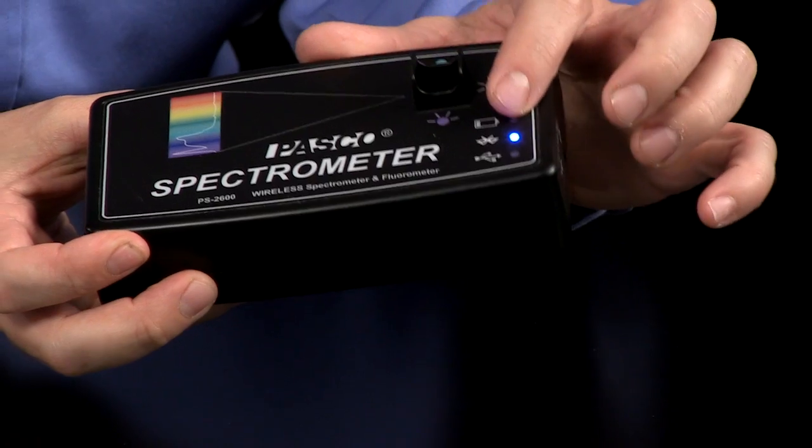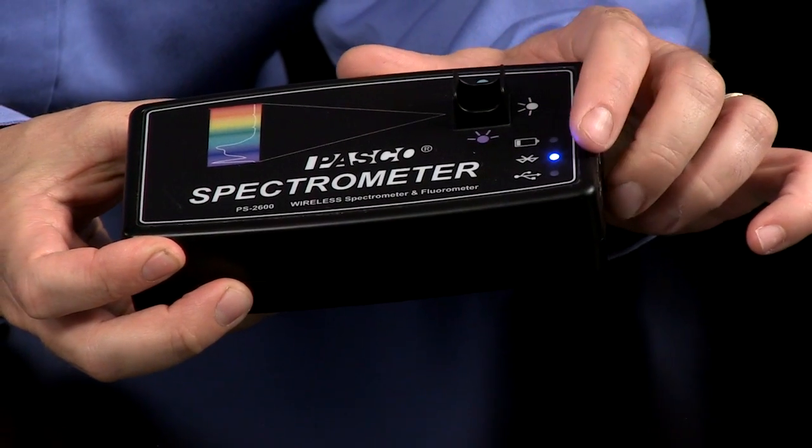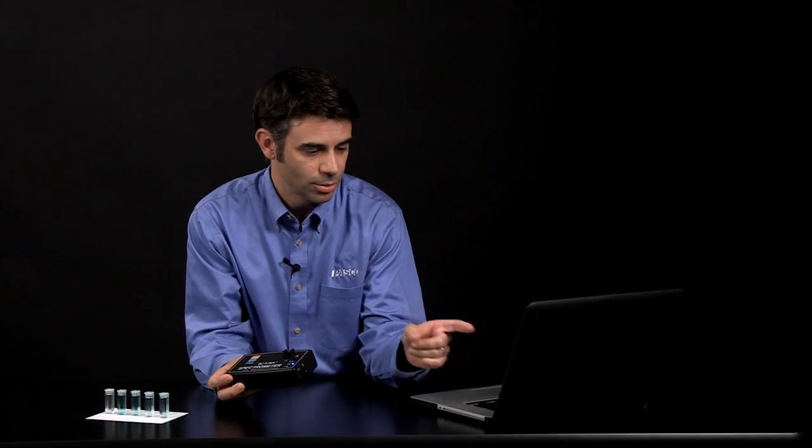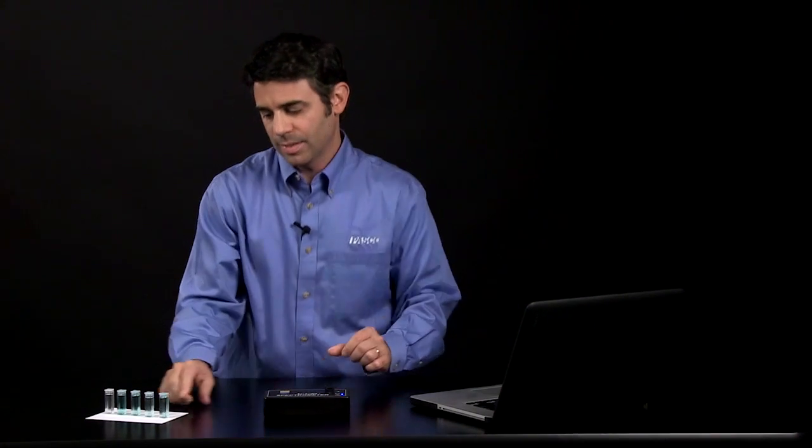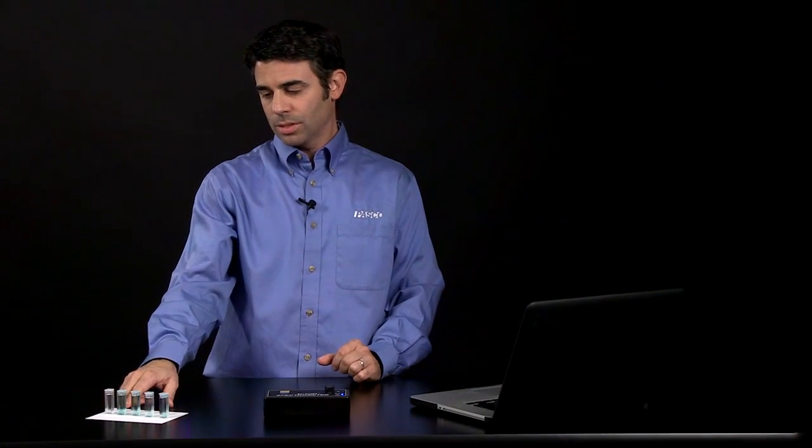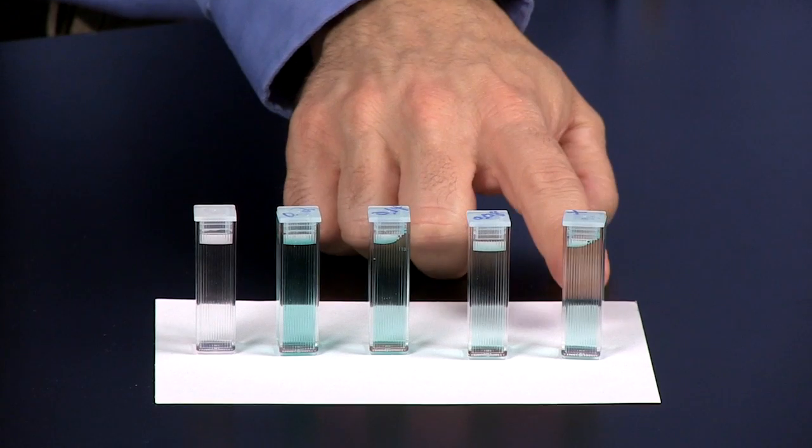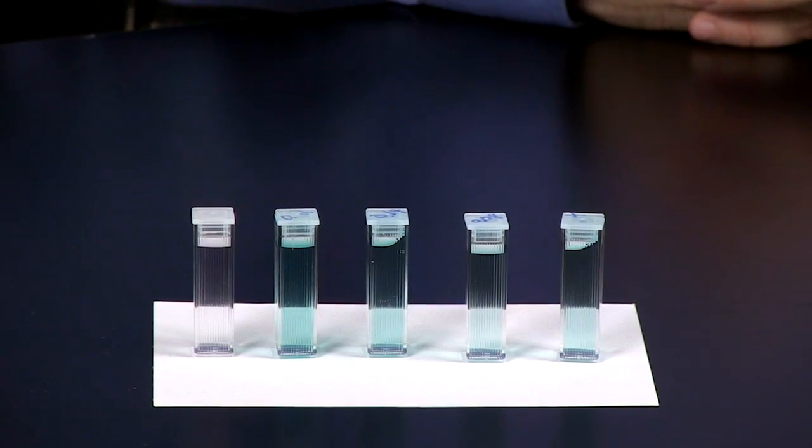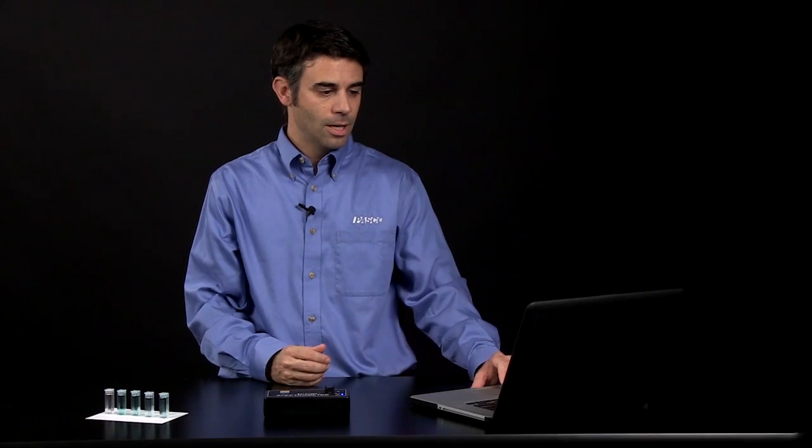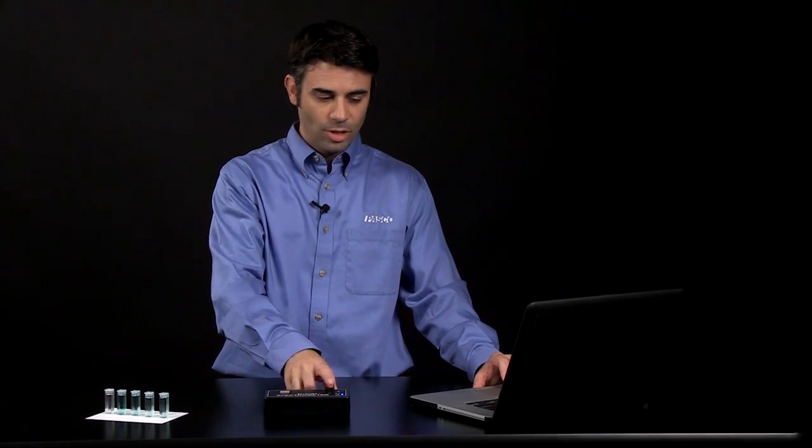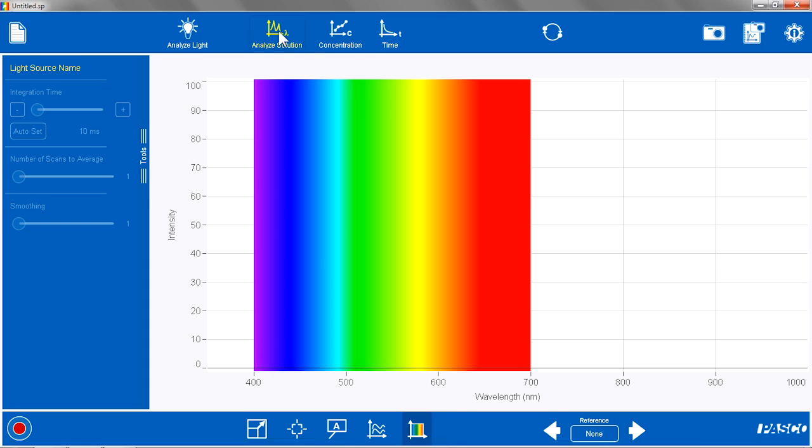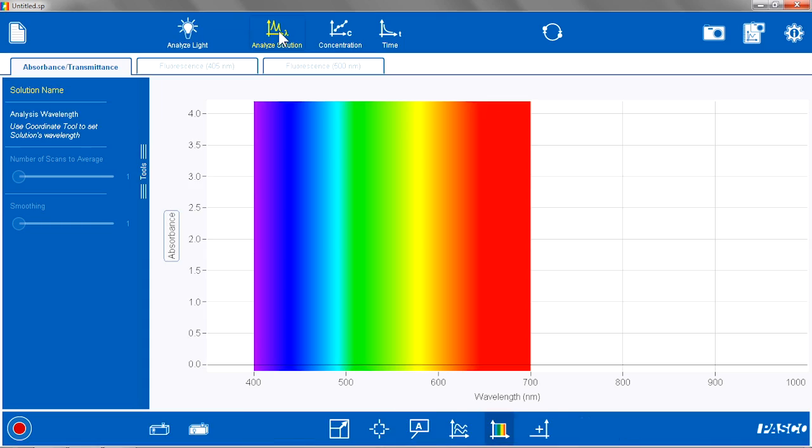So I have the PASCO spectrometer, Bluetooth connected to the computer, and I have a set of standard solutions and an unknown solution for my analysis. After I pair everything, I am going to go to the spectrometry program and go to Analyze Solution.